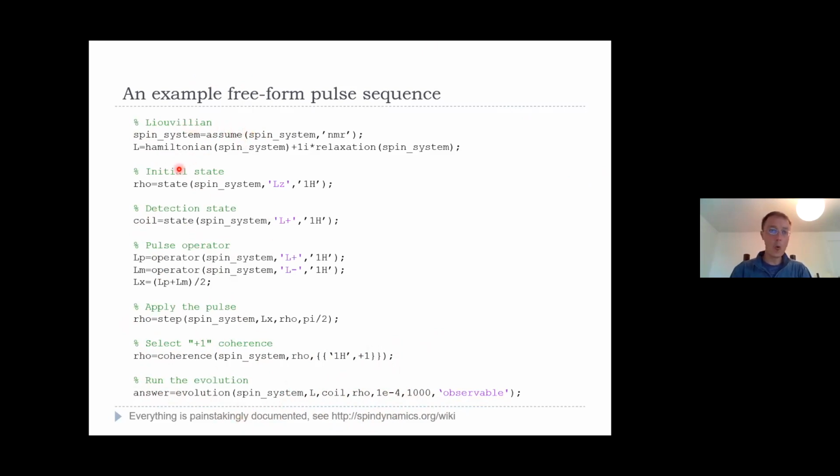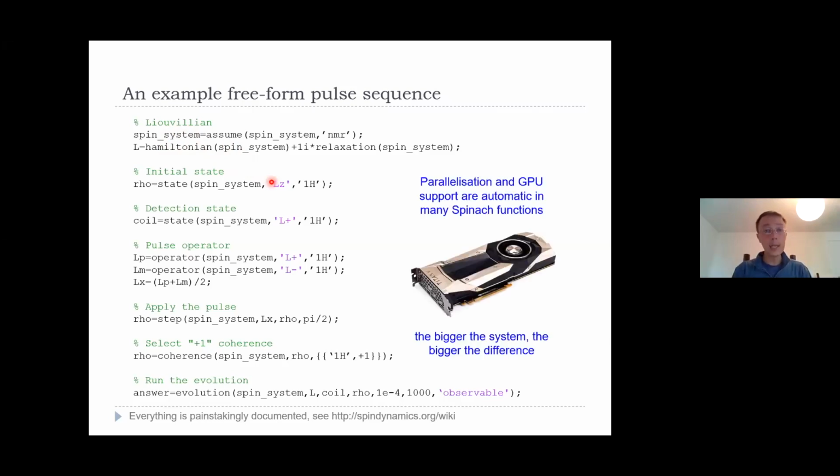And there's a horrendous amount of mathematics that went into every single function we are calling here. If you open Hamiltonian.m and look at the source code, years of programming that was, but it's now tidied up, packaged up, and it's just a dialect of MATLAB.